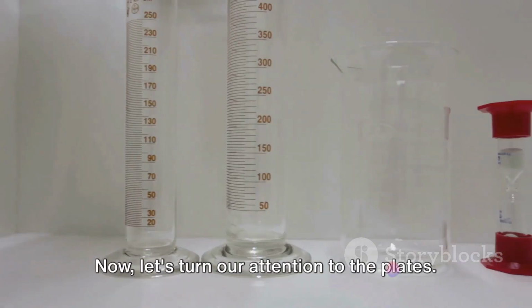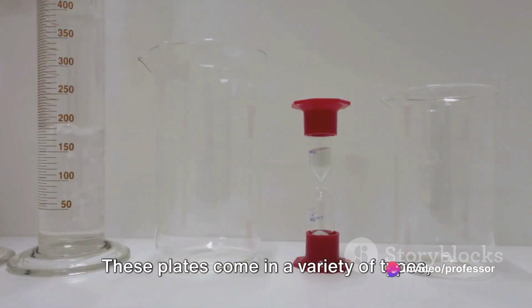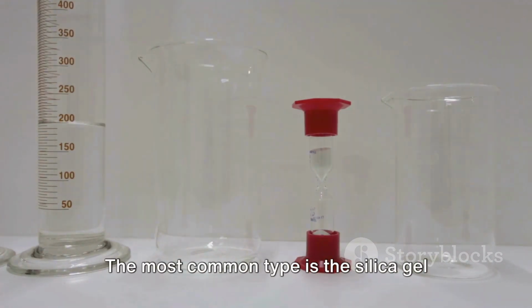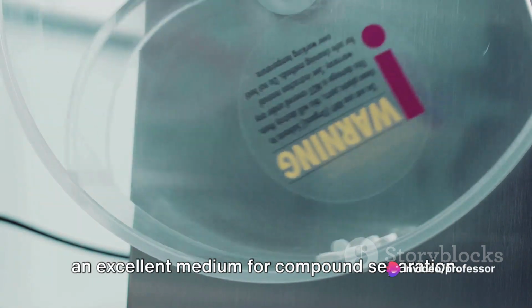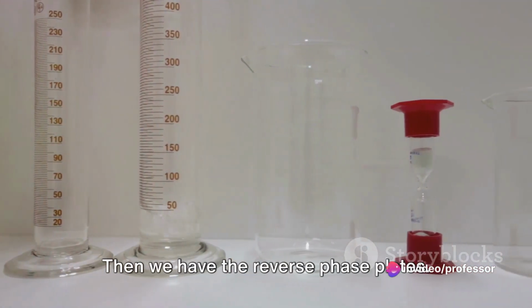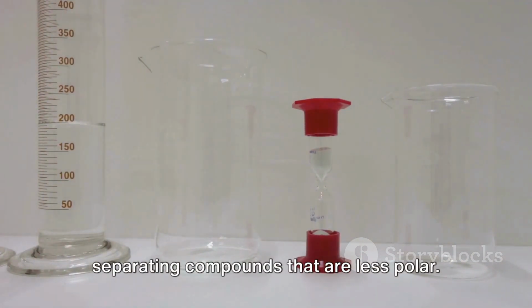Now let's turn our attention to the plates. The backbone of any HPTLC system is the chromatographic plate. These plates come in a variety of types, each serving a unique purpose. The most common type is the silica gel plate, with its porous structure providing an excellent medium for compound separation. Then we have the reverse phase plates. These plates are coated with a hydrophobic layer, making them ideal for separating compounds that are less polar.